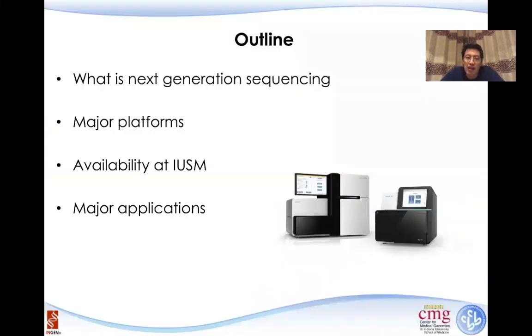Here's the outline. I will give a very brief introduction about next generation sequencing technology and go through some major platforms and availability at IU Medical School. And I will review some of the very basic major applications.